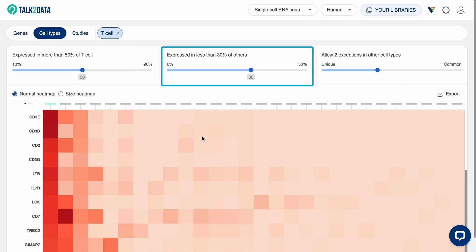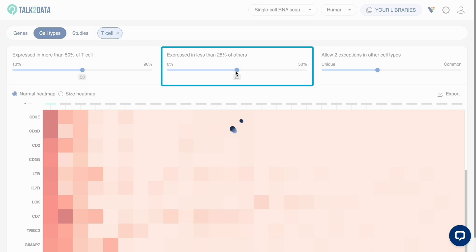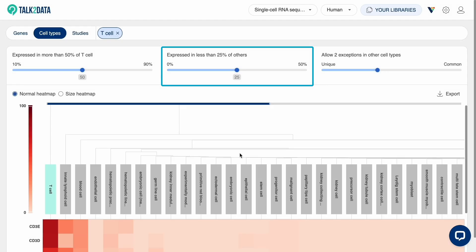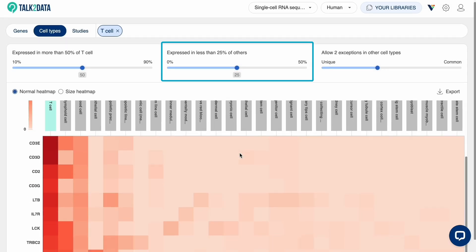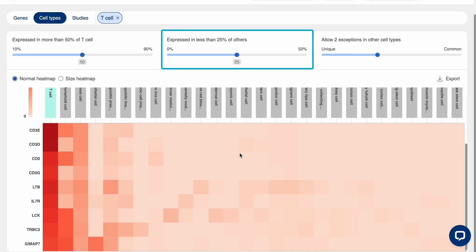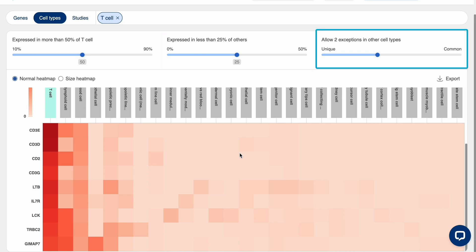The second parameter is the threshold for percentage of cells from other types that express the gene. Genes that are expressed in less than that percentage of other cell types are kept. The third parameter allows you to specify either 0 to 5 exceptions.